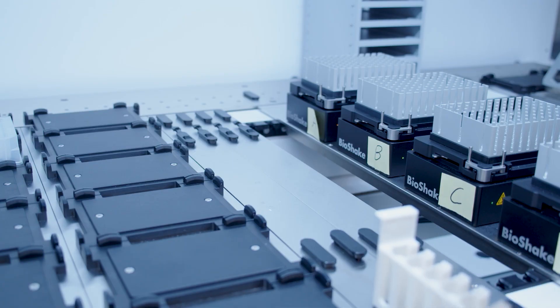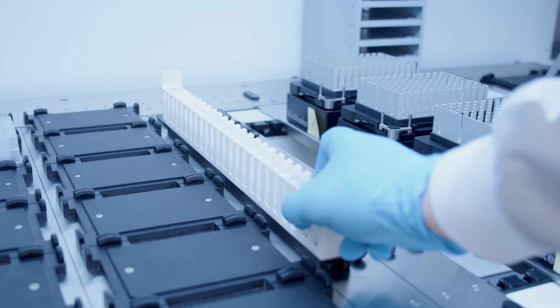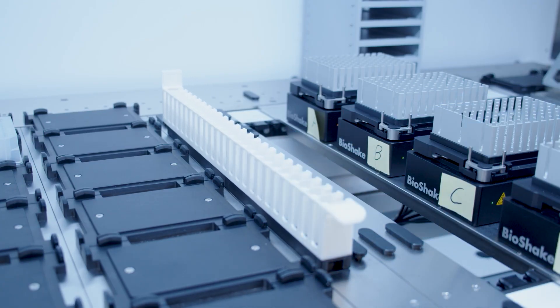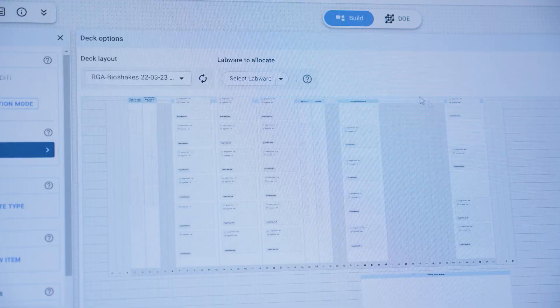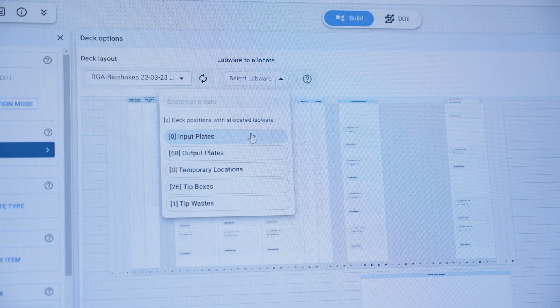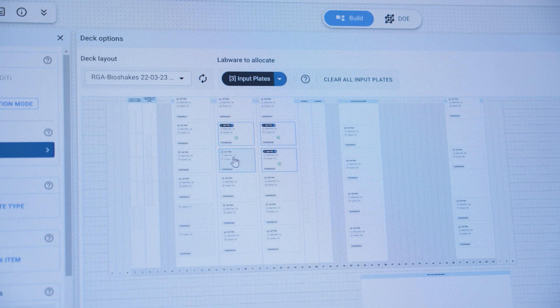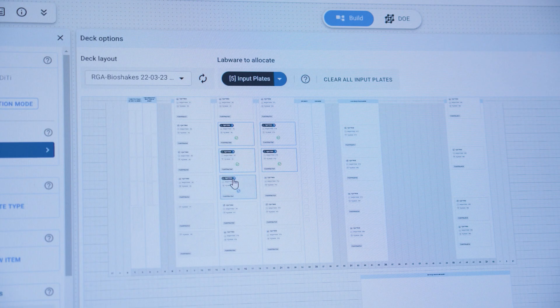Although parts of the deck are interchangeable, if you change anything you'll need to upload and select the new deck configuration in Synthase and that's not covered in this video. If you want your output or input plates to be in a specific deck position you can specify that here.